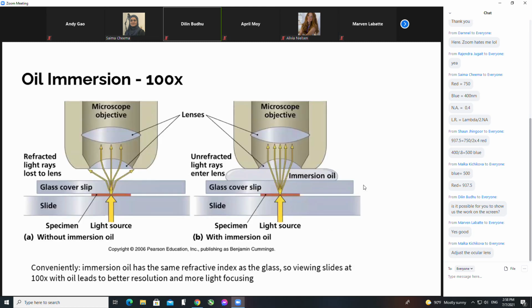Okay, thanks. Okay, so oil immersion lens, what is the concept of oil then? If we were looking at these microbes under the microscope in lab, there's no way we're going to see much under 10X or 40X. We really have to look at them under 100X so that the total magnification is 1,000 times, right? So you're looking at something 1,000 times bigger at that magnification.